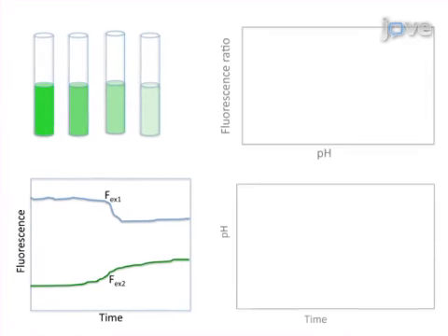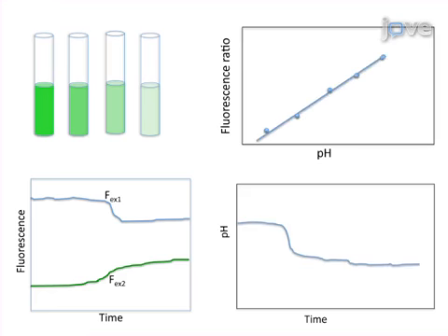Results are obtained that show time and condition-dependent pH conditions in the experimental sample based on ratiometric fluorescence ratios calibrated from the calibration samples.